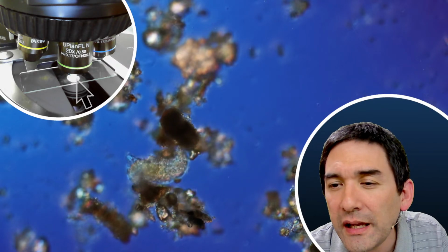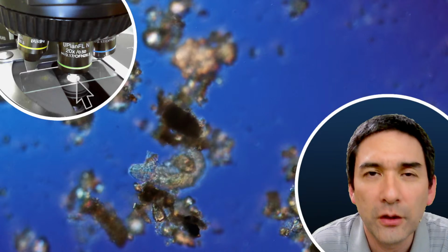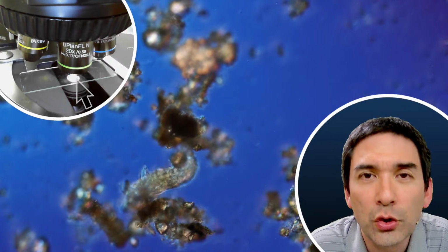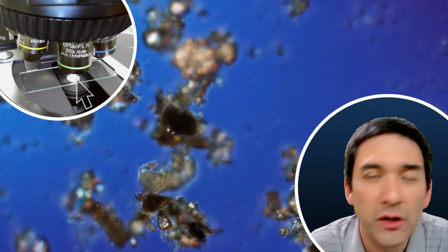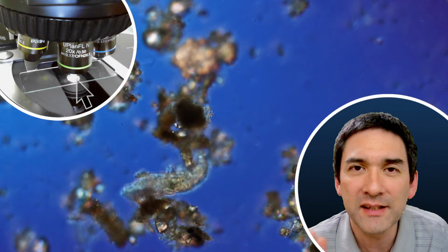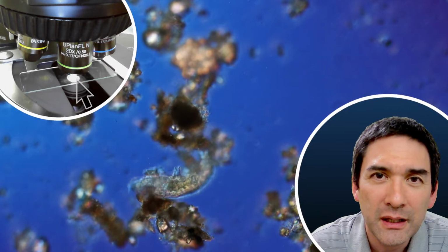I use spray air as needed for troublesome specks of dust. Be careful with spray air in a compressed container on optical parts. You can use just regular compressed air. What I've made myself is using a plastic bottle and a bicycle pump. It's possible to make a little compressed air container.